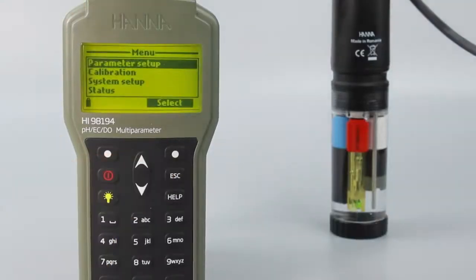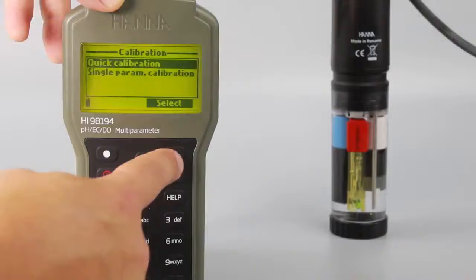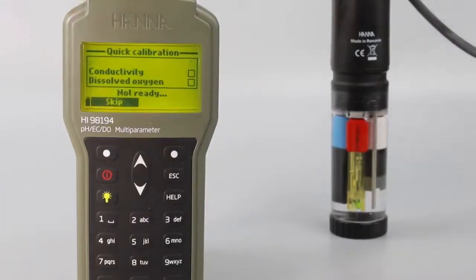From the meter, press menu and then calibration. From there, press quick calibration and follow the prompts.